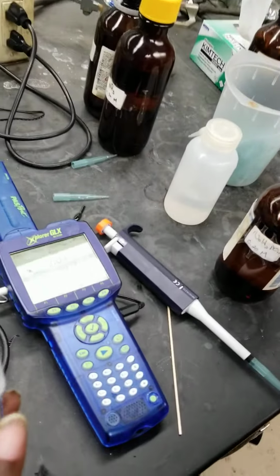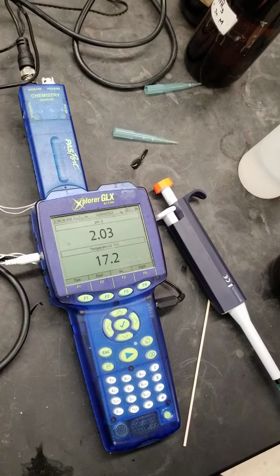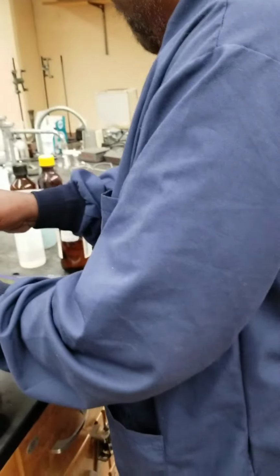Read the pH, the first number. Let's read that as 2.03. That's after the first 3 milliliters.